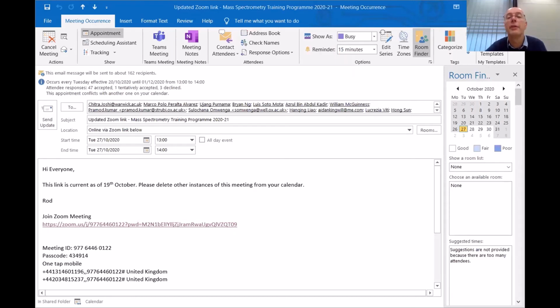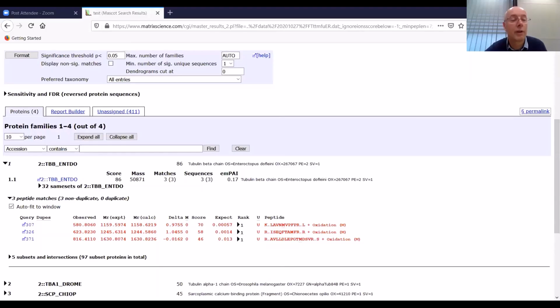No, that's the wrong place. I'm going to stop sharing again. Okay, I haven't really got an example to show you, not easily anyway. Let me show you this though. So I'm going to share screens with you again. Okay, hopefully you can all see this.